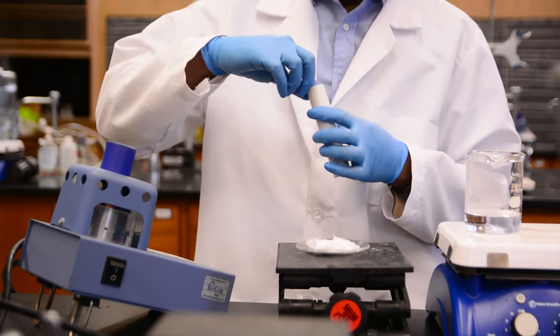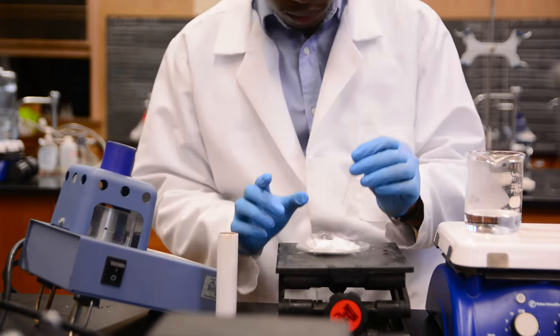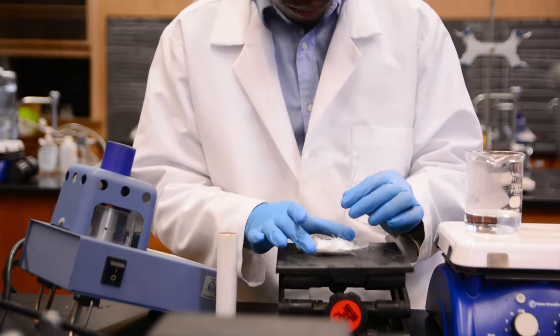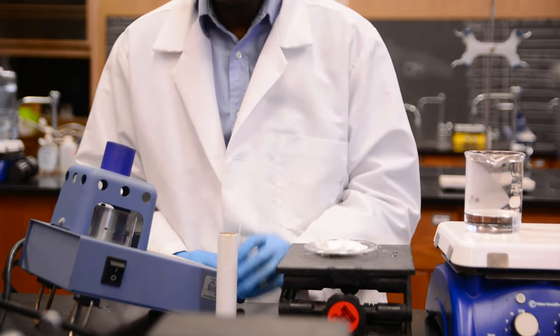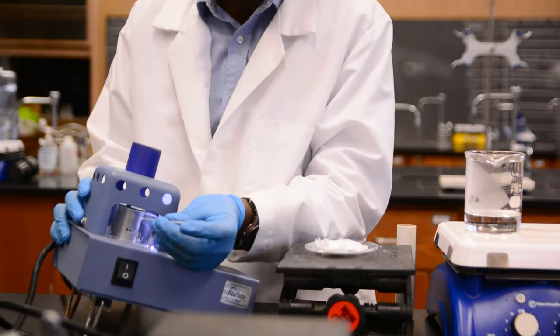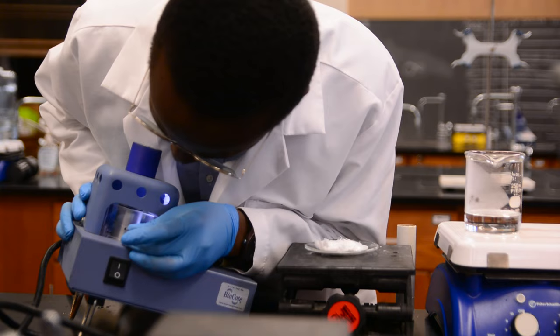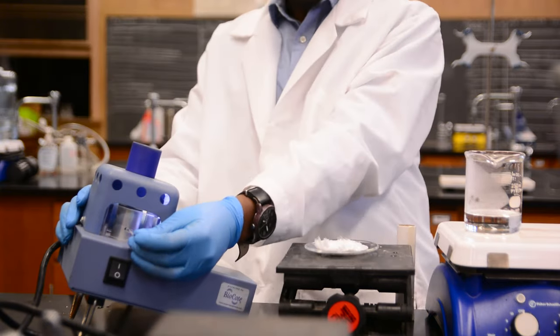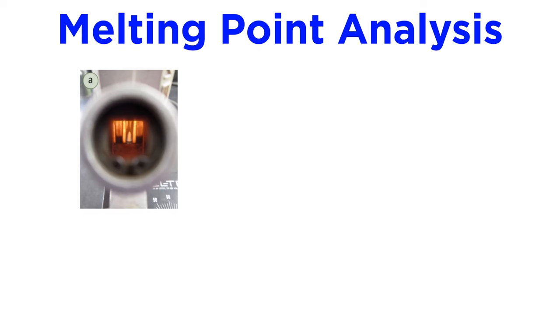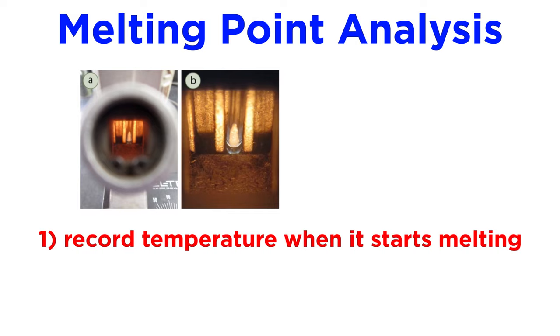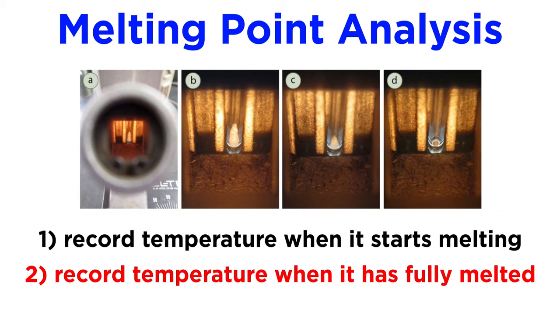To perform melting point analysis we need a melting point tube, and we need to insert a tiny sample of our solid. We then need to use some mechanical force to get this sample to the bottom of the melting point tube. Then we place it in the melting point apparatus, turn it on, and wait for the temperature to slowly approach the expected melting point range. As it nears, begin to watch through the eyepiece. As soon as you see the first signs of melting, record the temperature. Then, the moment you see that all of the sample is completely melted, record the temperature again. That is your melting point range.